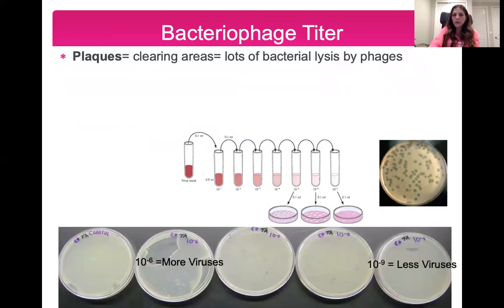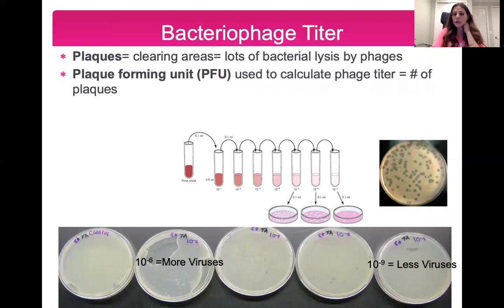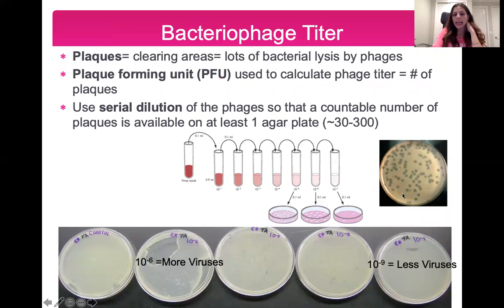After incubating your plate, you're looking for clearing areas which we call plaques. Every time you see a plaque or clearing area, it means that a lot of bacteria died or lysed because of infection by phages. Looking at this plate, the yellow or white areas are all bacteria, and any hole or clearing is where bacteria died due to the phage — that is a plaque. To calculate phage titer, we look at plaque forming units (PFU), or the number of plaques on a plate.